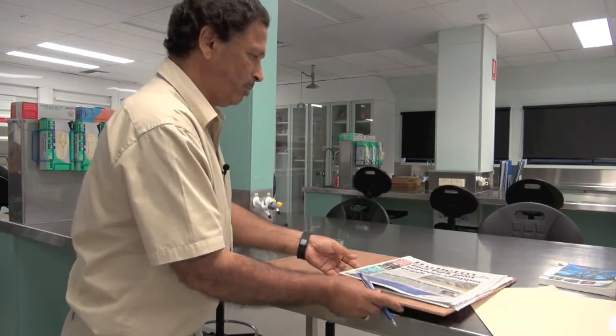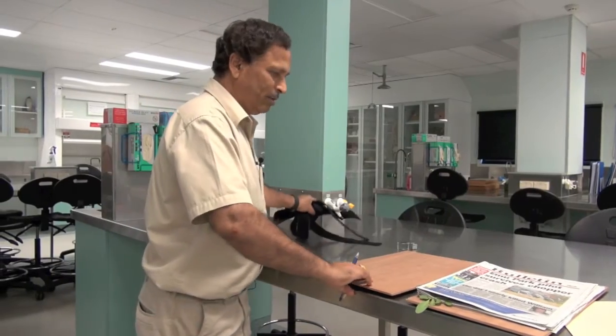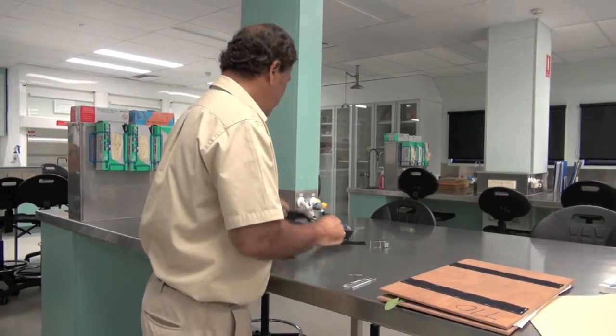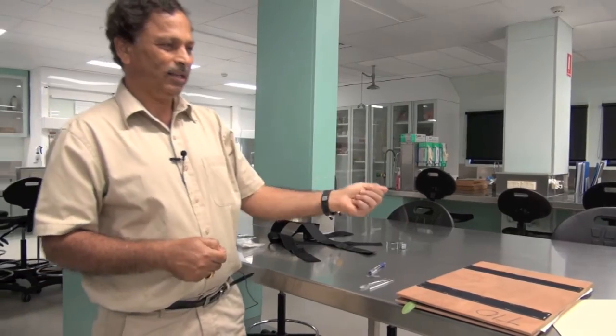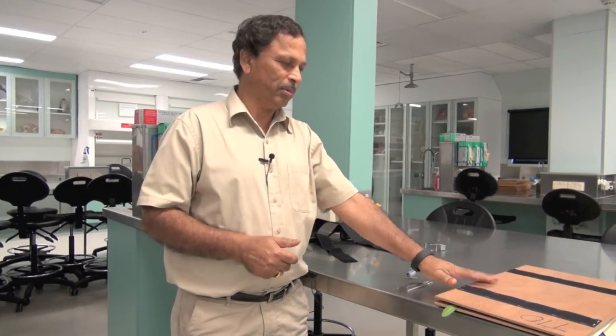So this is the way you need to prepare. Get all these things, plus the plant press, and once you take them and go to the field, collect the specimen and then mount it on the plant press.